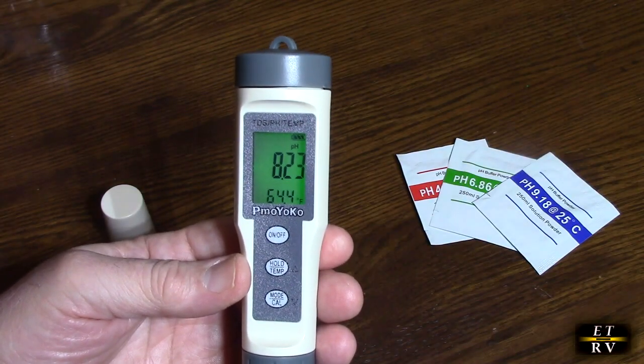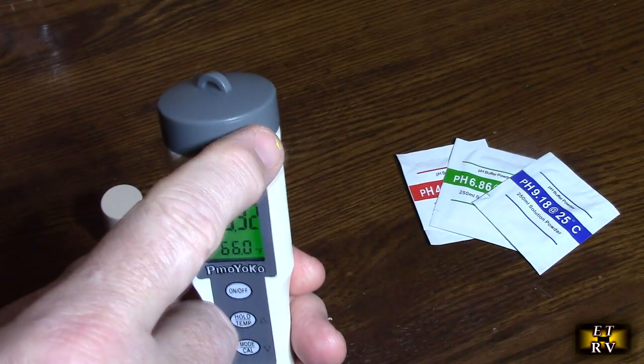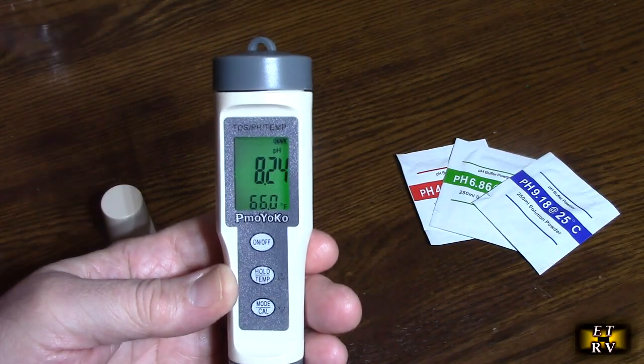Those batteries, I've used this for about two years and it was fine. Again, keep those batteries in a little baggy until you're ready to use it and you'll get a lot of use out of those batteries.